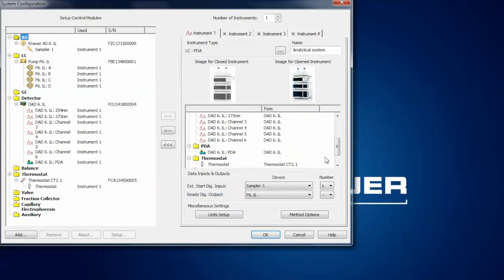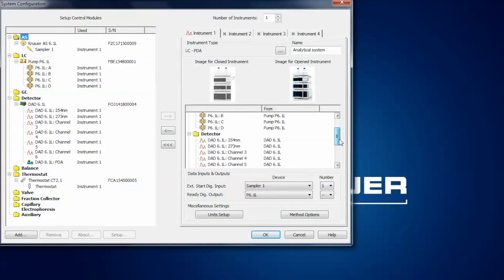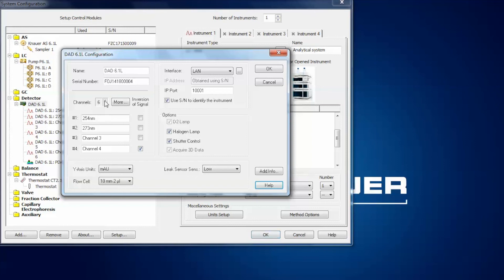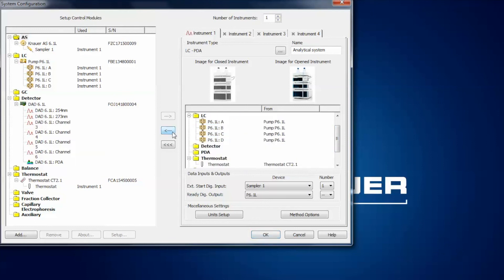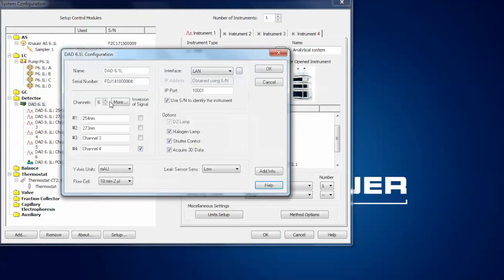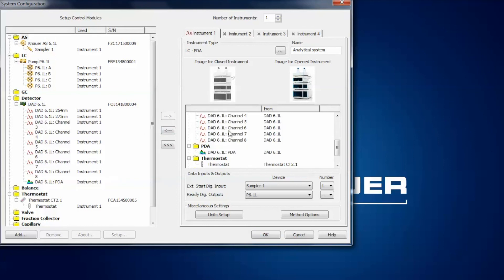One additional thing: you cannot change the number of detector channels as long as the detector is added to the instrument. If you open the detector configuration while it is part of the instrument, the channel number field is locked. First remove the module from the instrument, then open the configuration and you will see it is now possible to change the channel numbers. Click OK to confirm and add the detector back to the instrument. So always remove the module from the instrument before making modifications, then add it back again.